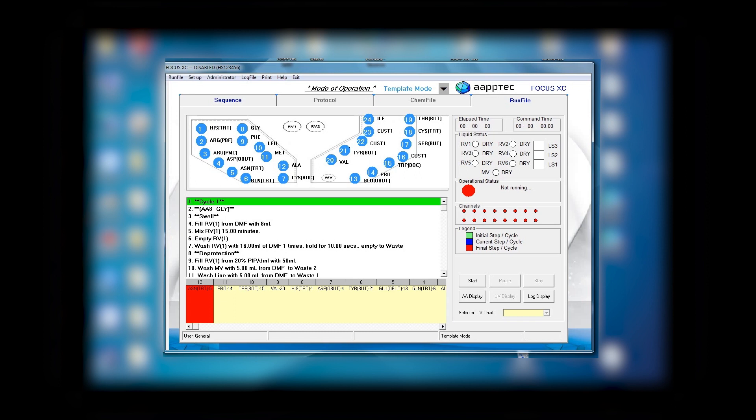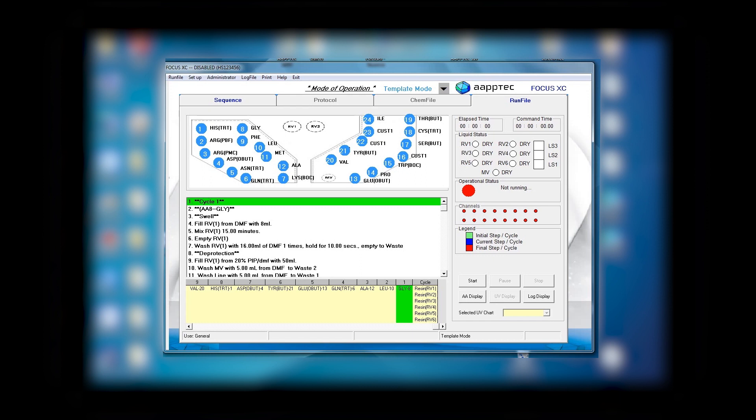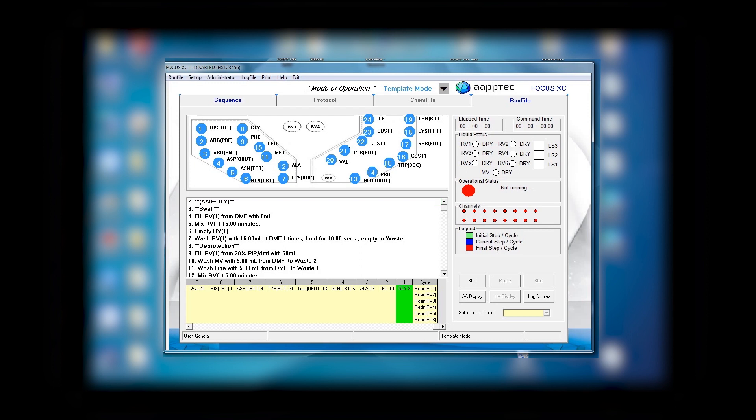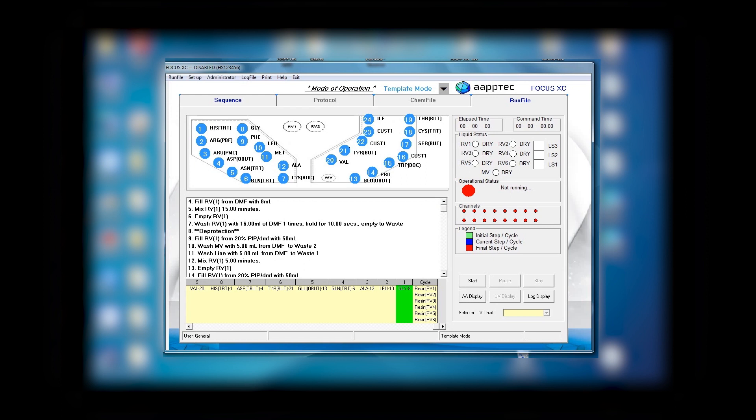Let's take a look at the protocol. You can see here it is filling the RV one with the DMF with 8 milliliter, which is what we told it to do. We also told the software to mix for 15 minutes, then empty RV one and wash with 16 milliliter DMF, hold it for 10 seconds, and then empty to the waste. The next step is deprotection occurring in RV one. Remember that if you have more than one reactor, it tells you the reactor number.